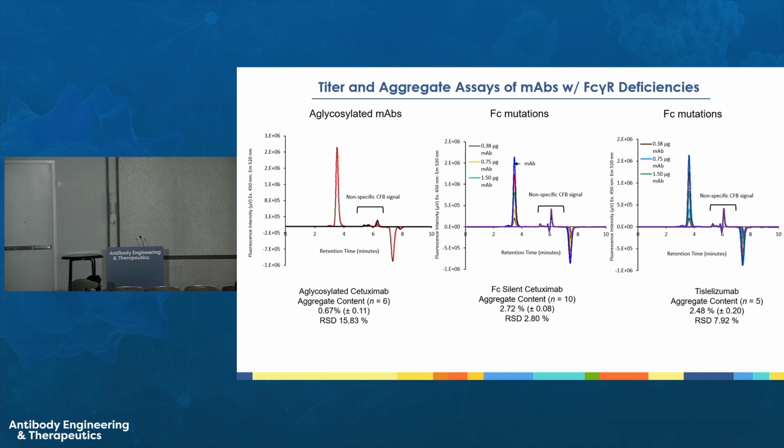I think you showed most of the work done with just one fluorophore binding the Fc region. I was curious, you mentioned in the beginning of the talk that you can label the antigen as well. Can you also add that to this kind of column and do this biological testing, as you mentioned, where you can test for two fluorophores at the same time?